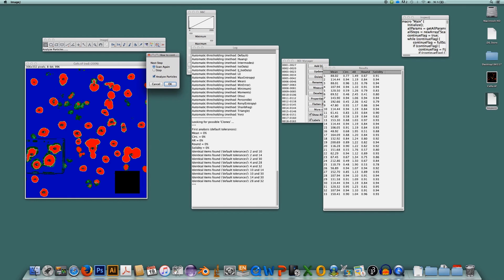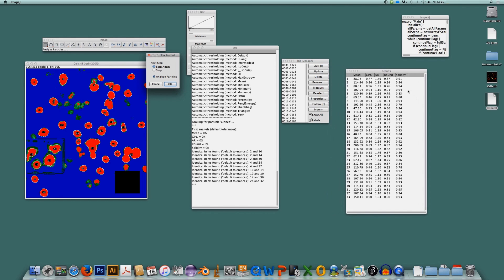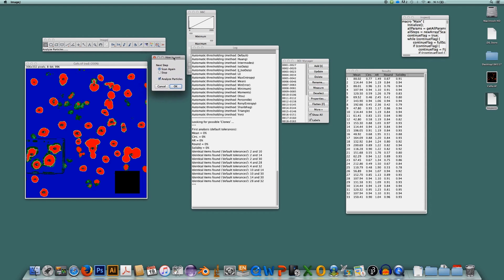But InspectJ can do much more. It cannot only find such areas, it can also look for clones which are identical items within the image. It performs an object analysis. And all these objects are listed in the results table and they are listed in the ROI manager list which you can see here.